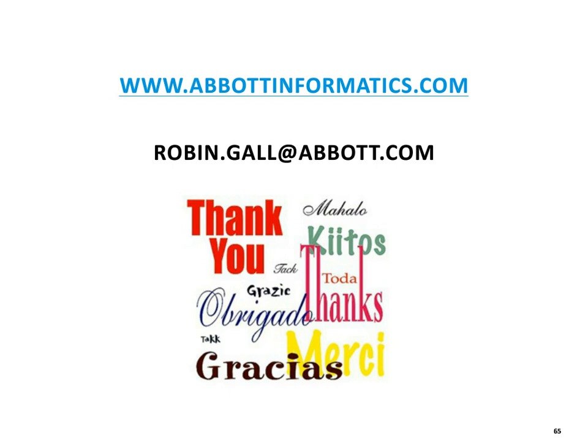While I have you, Robin, you mentioned that there's a trend towards web-based LIMS. Could you explain how your data is protected in a web-based LIMS system? Yes, most of our clients choose to install the software on their own servers, which are behind a VPN, behind their firewall, and people from outside would VPN into that.